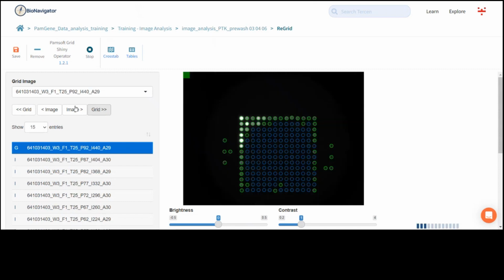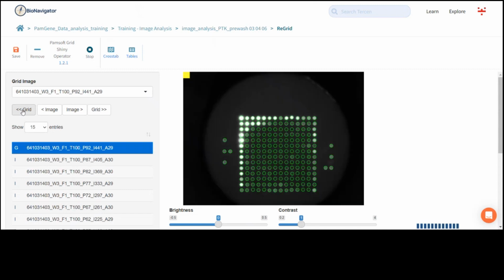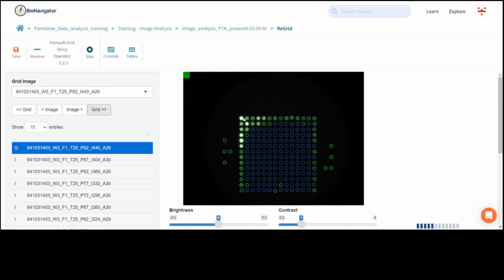And then just click on next. If you go back, you can see that the grid was saved. The other way is when we want to replace only one spot by one: click inside the spot, click in the middle of a grid and then replace.